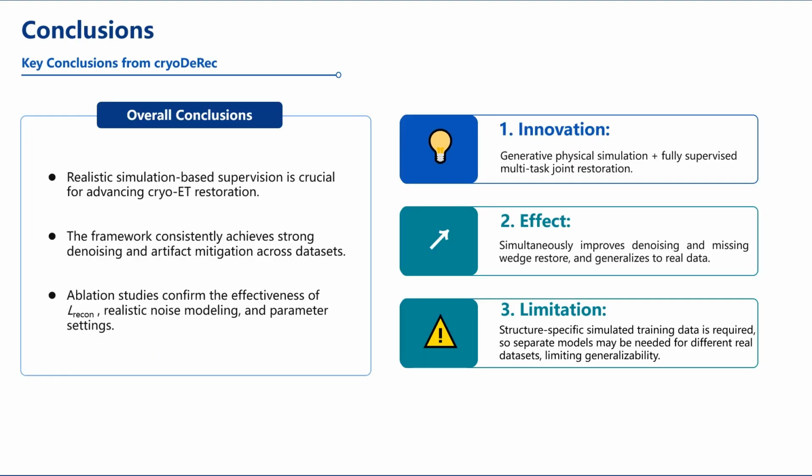To conclude, this paper proposes cryoDeRec, a supervised multitask framework for joint cryo-ET restoration. The main innovation is the combination of generative physical simulation and fully supervised multitask joint restoration. In terms of performance, cryoDeRec simultaneously improves denoising and missing wedge restoration, and shows good results on both simulated and real datasets. The ablation studies further confirm that realistic simulation-based supervision, WGNGP noise modeling, and a multitask loss are all important for improving restoration performance.